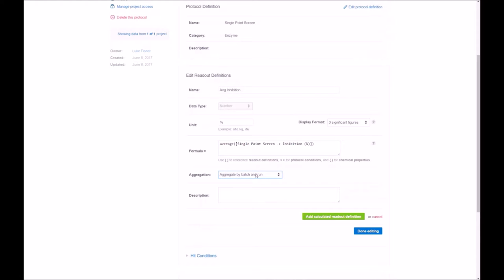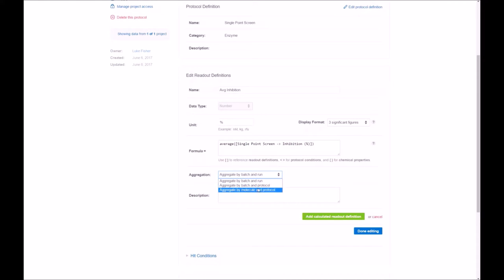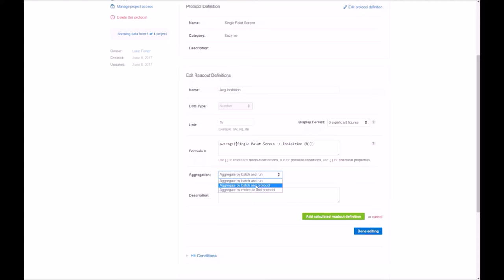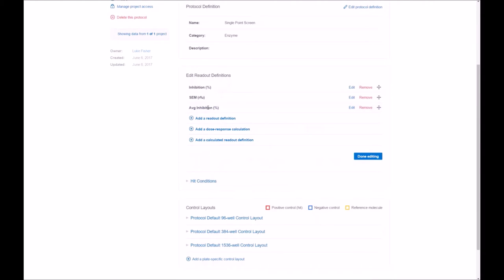Here, we're going to select the default of aggregation for batch and run. You do have multiple choices available for the aggregation. If you wanted an average score, let's say, for an entire molecule, a single score, as well as if you wanted to look at multiple averages based on the batches that are used. Again, the description is available. Click add to add it to your readout definitions.